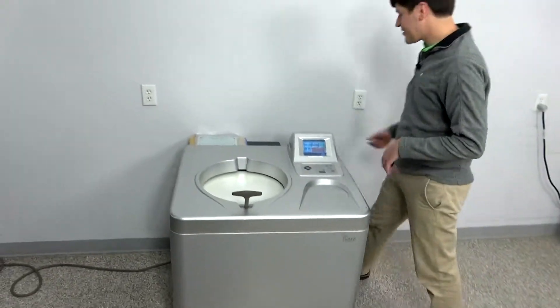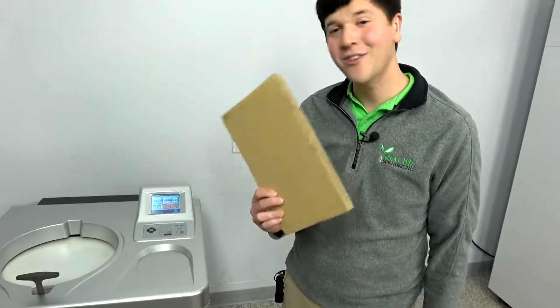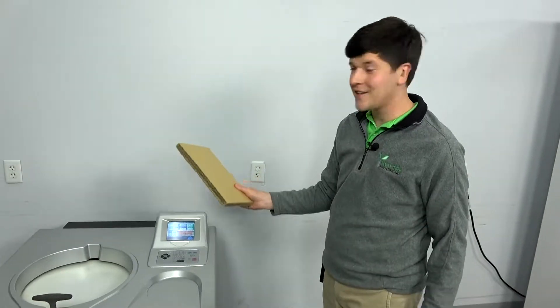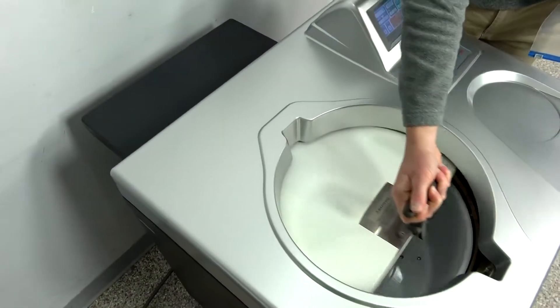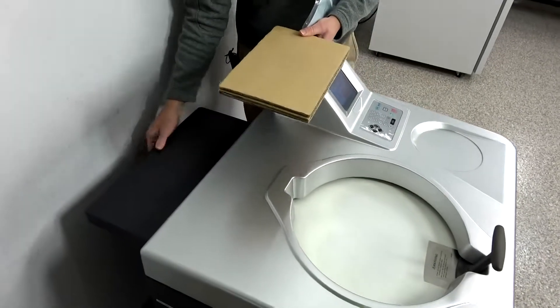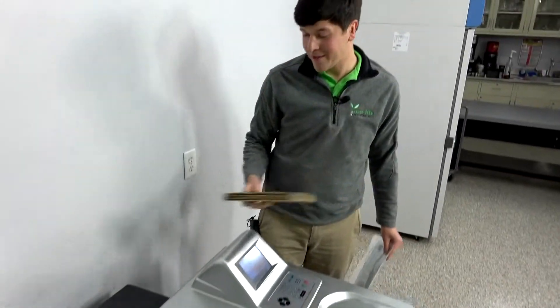There are a couple little trinkets that come with this that you may not realize are important. One is a little piece of cardboard — believe it or not, it's a good one to have. When we ship this to you, we'll be taking off the back spacer that allows proper ventilation but also gives the door a little hiding place when it's opened. This cardboard goes in that empty space inside the panel so that your door doesn't fly open during shipping.